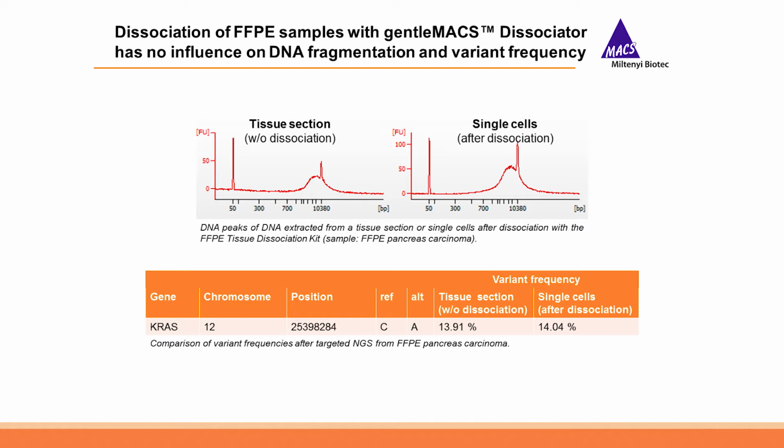When you want to do DNA sequencing, it is important to get enough amount of nucleic acids, of course. To do next-gen sequencing, you typically need a minimum of 100 nanograms of DNA. So here's just one example where we have prepared DNA from two 50 micrometer sections. Please keep in mind that this is just a number from this sample, and DNA amount strongly depends, of course, on the tissue size and the wax blocks, the cell number that you can isolate from the cells, and of course the age of the sample, since DNA gets degraded over time, it gets oxidized, for example.